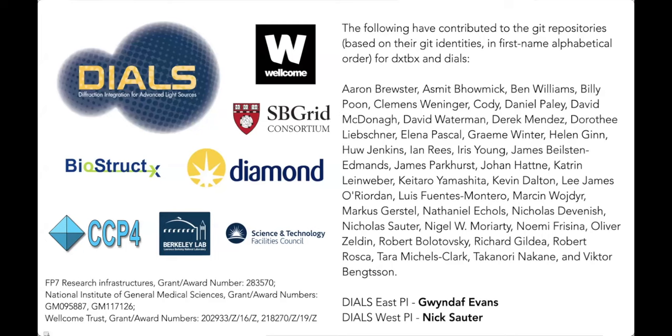Well, thank you, Graeme. That was a very interesting overview of what's new in Dials. And yes, we do have questions from the audience and for me. But I guess we should probably start off with the audience ones. So when you were discussing the user configurable masking, is the thresholding for spot finding also something that's user tunable?